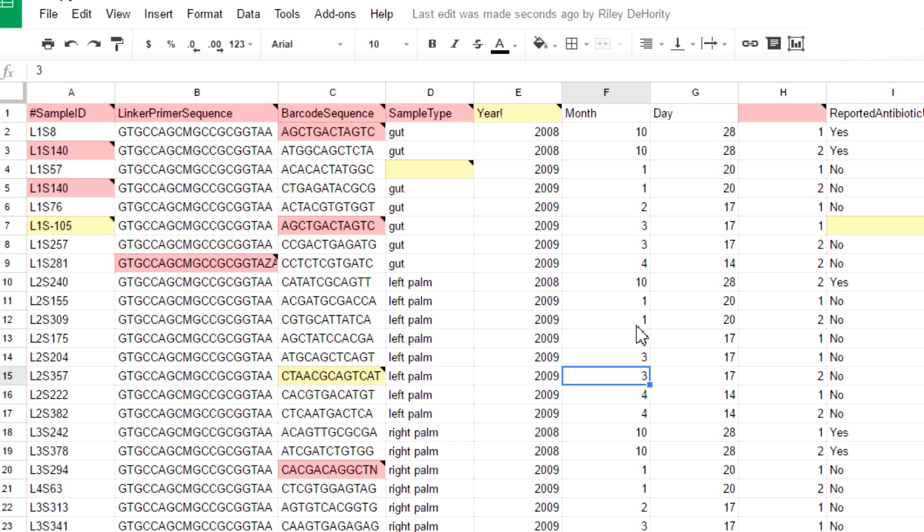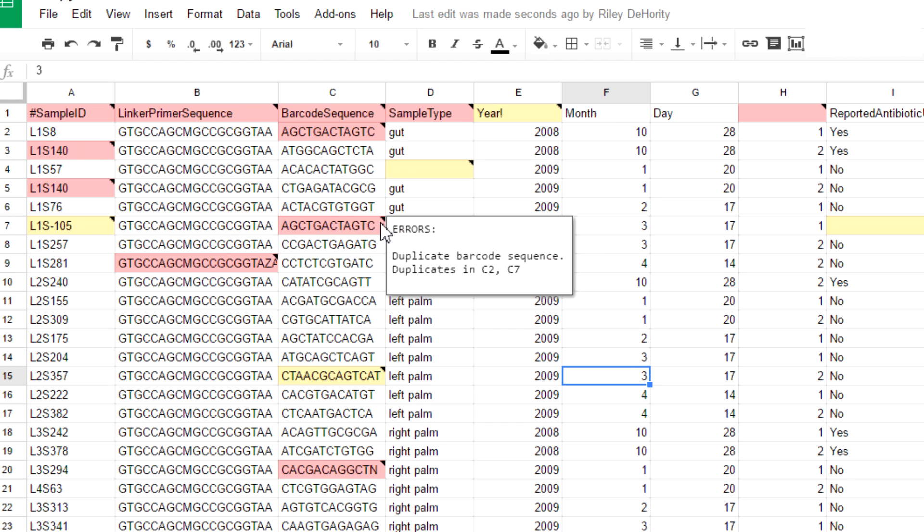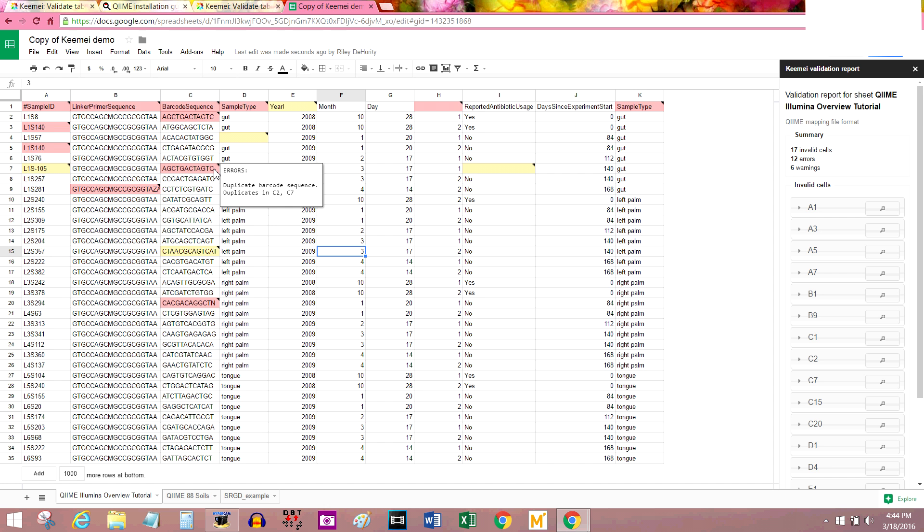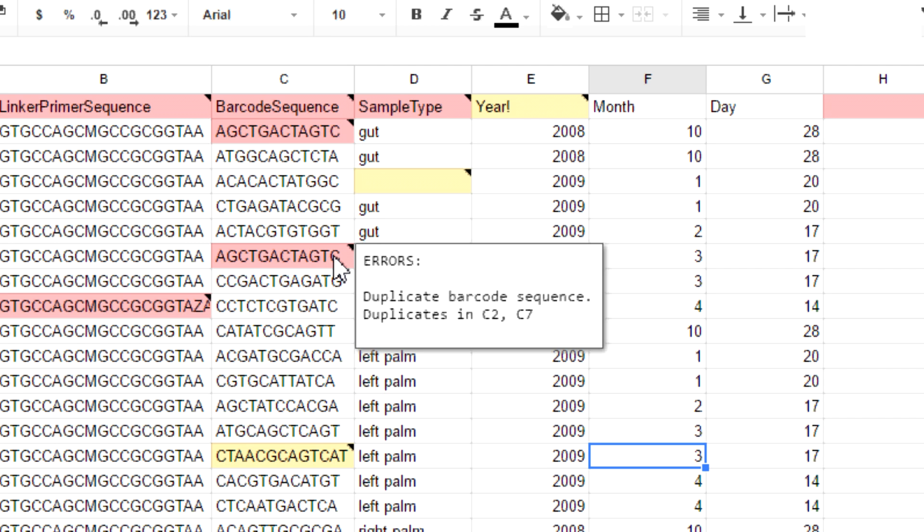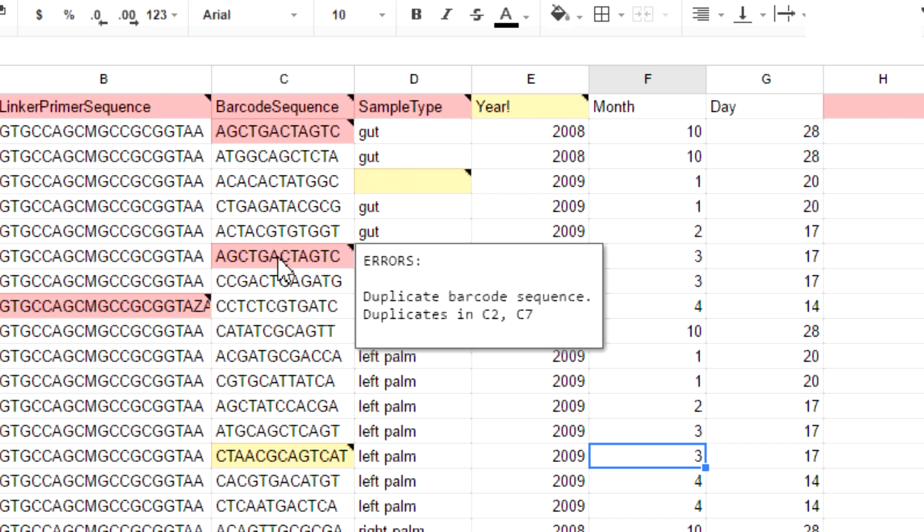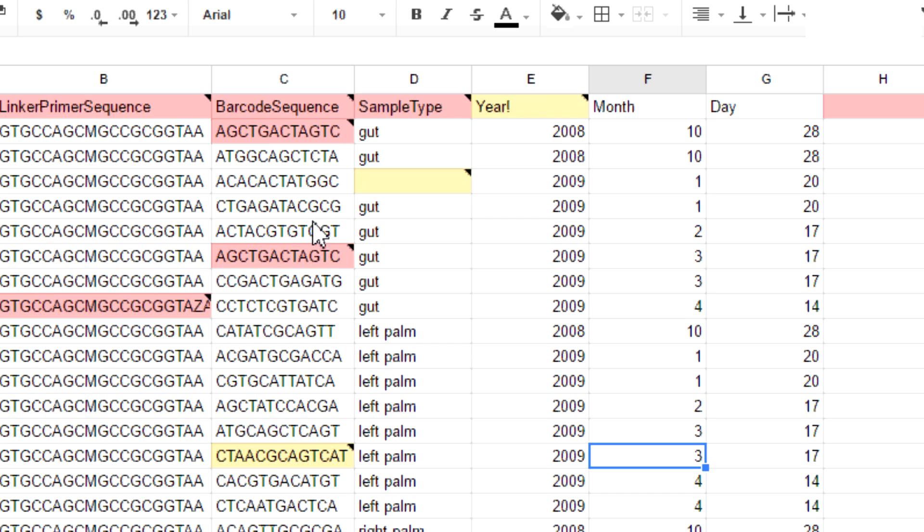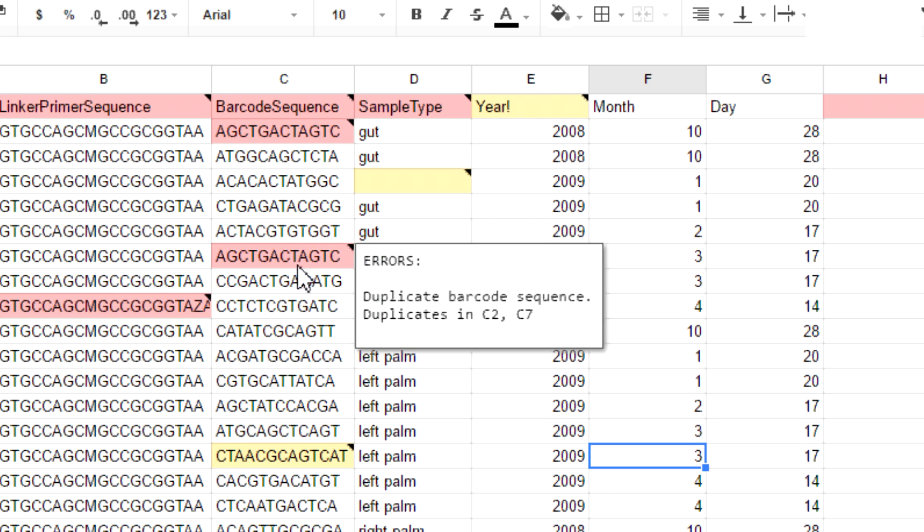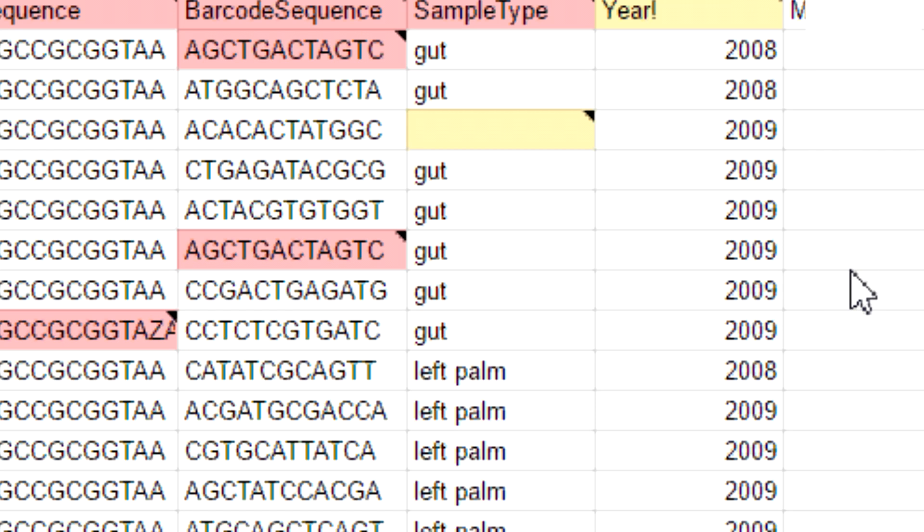This would be a good time to mention one of the biggest caveats with using this software. You cannot have colors in your cells and you also should avoid using notes. If you have notes and background colors in your original sheet, they will get deleted. They will be erased. They will be no more once you run this add-on. So make sure to have that information saved somewhere else if you're planning on using this.